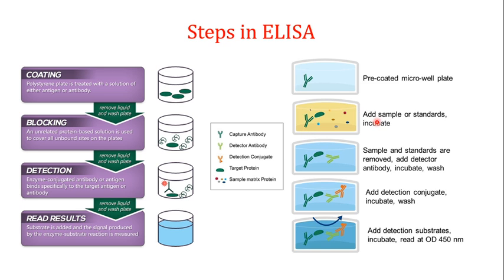Then you will be adding your sample or your standards. So when you add your sample, the antibody will be specific. In the sample, your target protein is going to interact with the capture antibody, and your antigen or your target protein will be immobilized in the well.